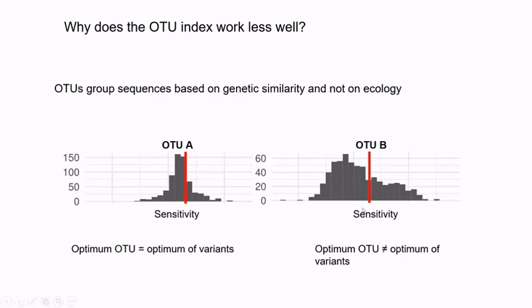You can imagine that here there is probably one species, maybe a second one here, and a third one here. Then when you calculate the ecological profile and the sensitivity value, sometimes it's okay. Here it's not a problem, but for this OTU, the sensitivity does not correspond to reality, and maybe there are three species, and when you calculate the sensitivity value, it's different from the real optimum.